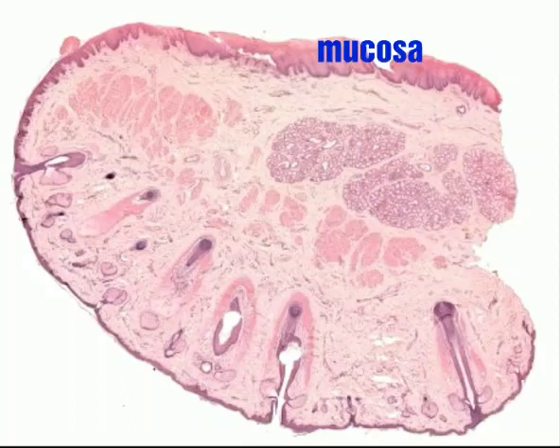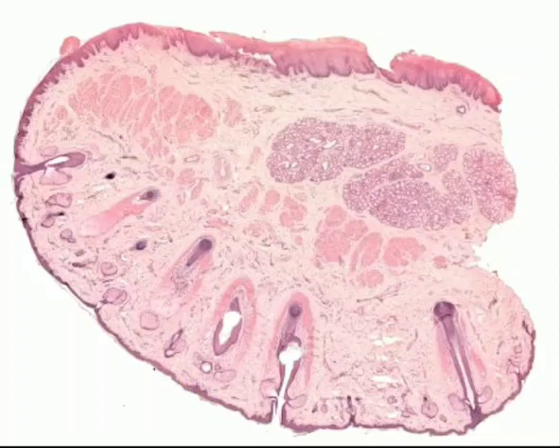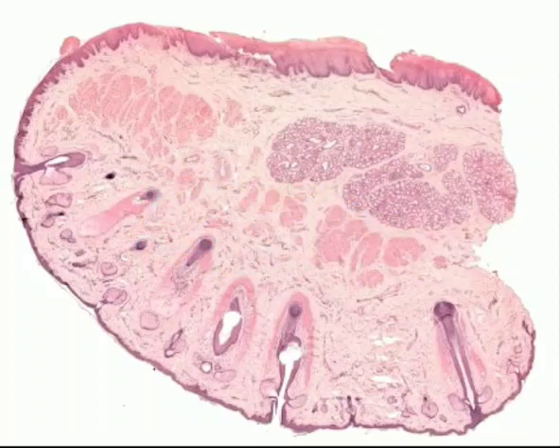This is a section of a lip which is lined internally by mucosa — that is stratified squamous non-keratinized epithelium — and externally by true skin. The core of the lip is made up of skeletal muscle fibers, which are fibers of the orbicularis oris. Internally to the skeletal muscle fibers, we find a few minor salivary glands, that is the labial glands.